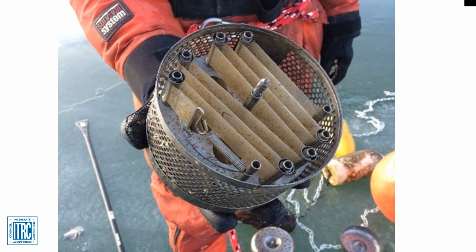Chemicals captured by the sampling device can be extracted in the lab using a two-step dialysis method. Dialysis is a common laboratory technique that uses diffusion to separate, isolate, or otherwise partition molecules of the target analytes. First, the LDPE membrane material is subjected to superficial cleaning to remove any particulate matter and biofilm. Then it is immersed in a solvent such as hexane. Following dialysis, additional cleanup and fractionation of the samples depends on the target analytes, but typically involves size exclusion chromatography and other sorbent-based chromatographic methods.